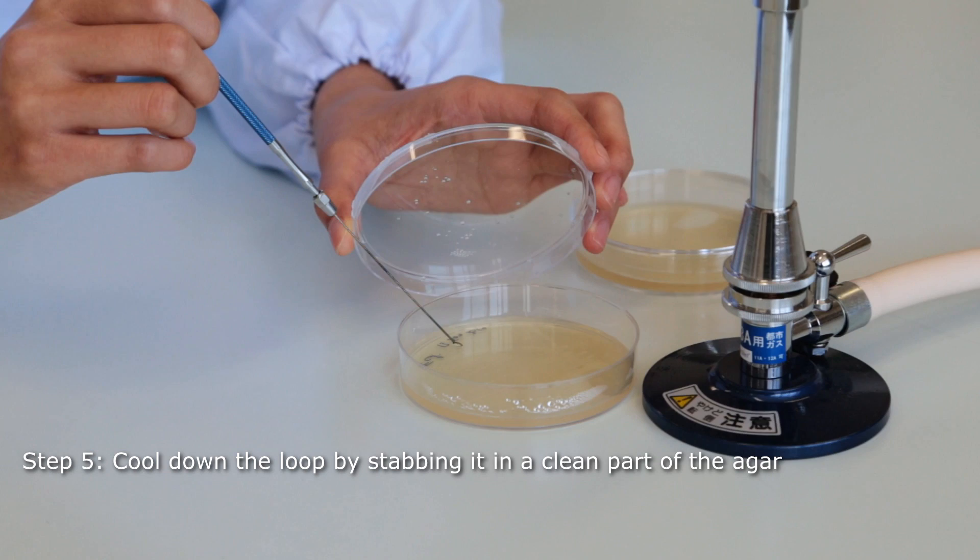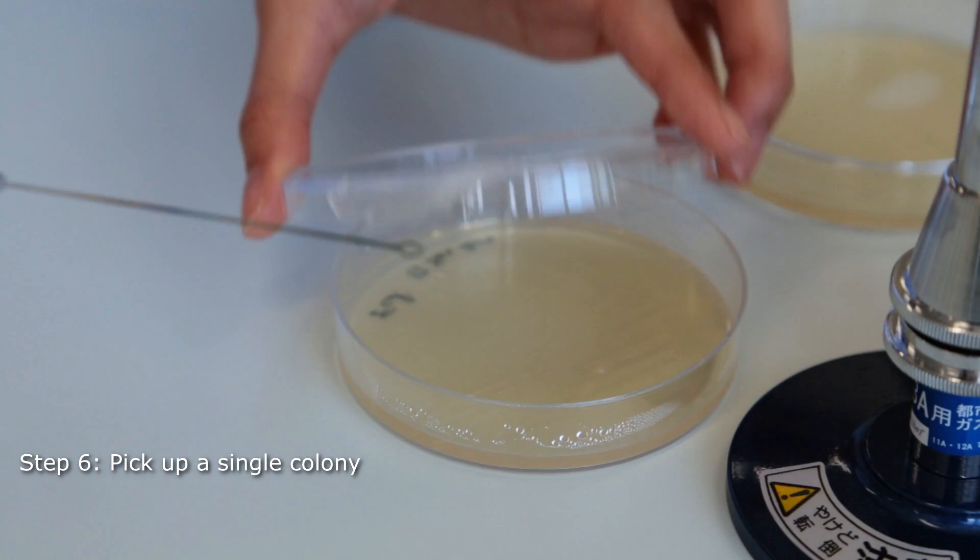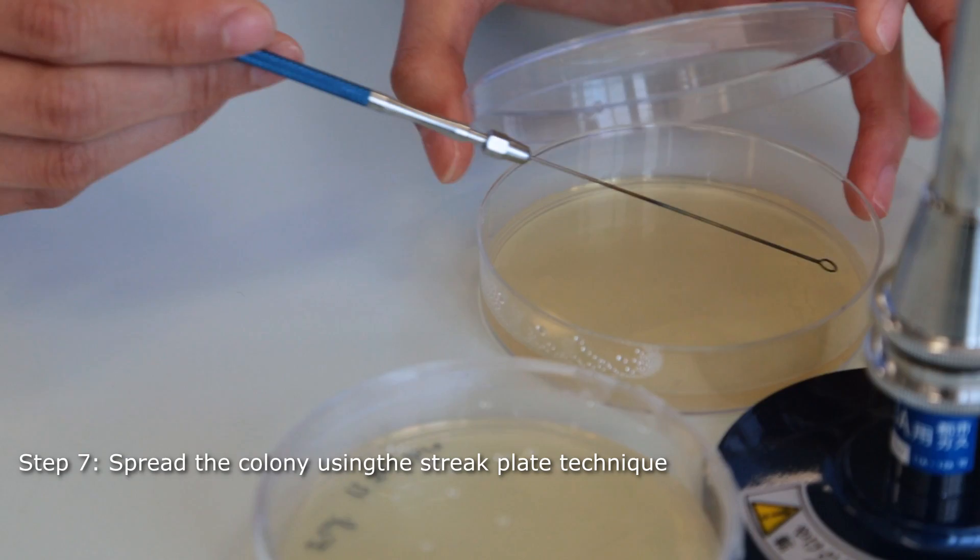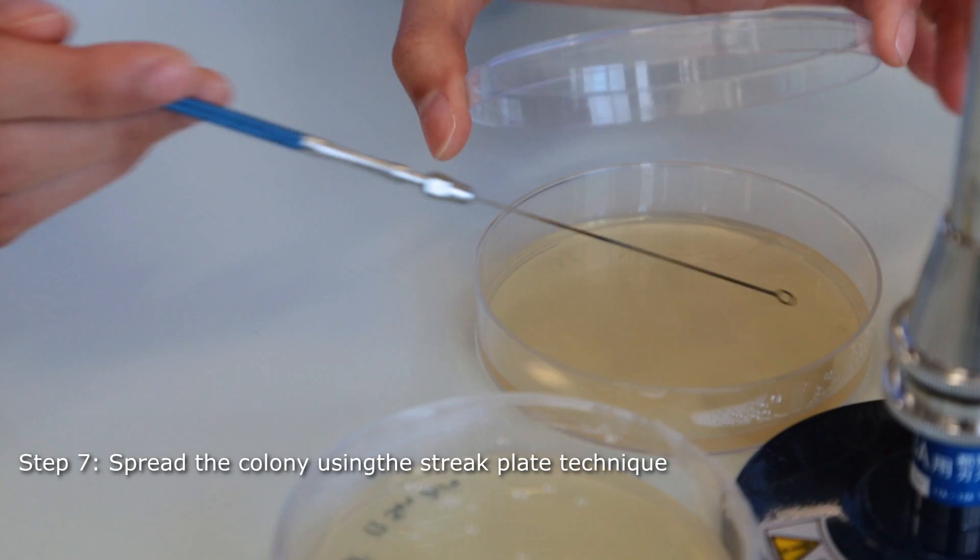Pick up a single colony by touching it with your loop. Streak a clean petri dish using the quadrant method. The goal is to reduce the bacterial load at every streak to separate single bacterial cells. Do not let the loop go back into the previous quadrants, where most of the original inoculum was deposited.